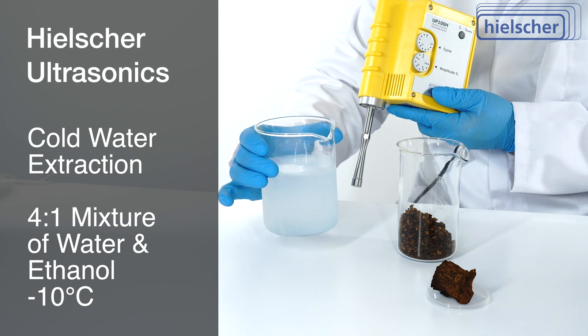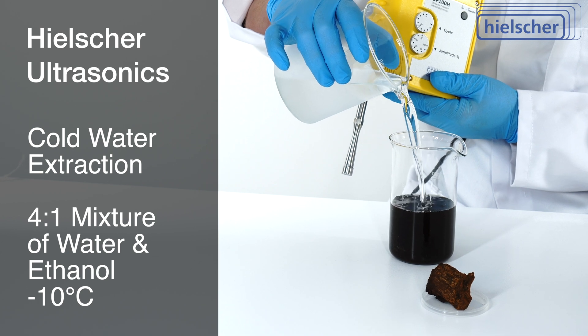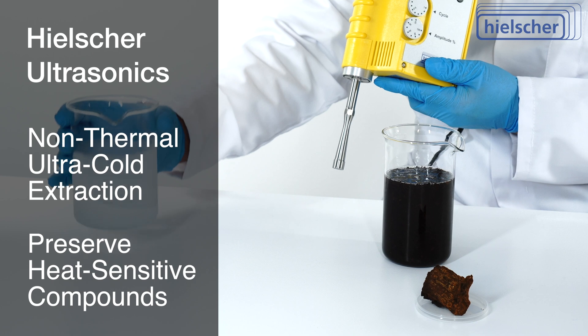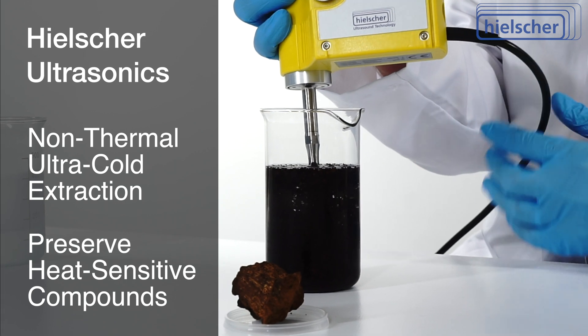We add a 4-to-1 mixture of cold water and pharmaceutical grade ethanol so that we can extract at minus 10 degrees Celsius. This non-thermal, ultra-cold extraction preserves the maximum amount of heat-sensitive beta-glucans, phytonutrients, and vitamins.